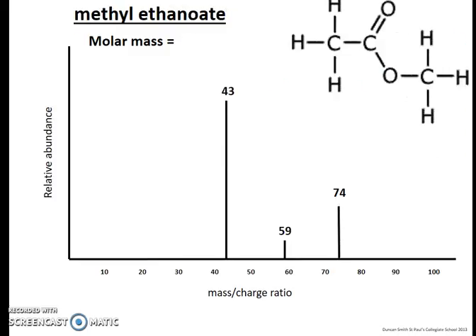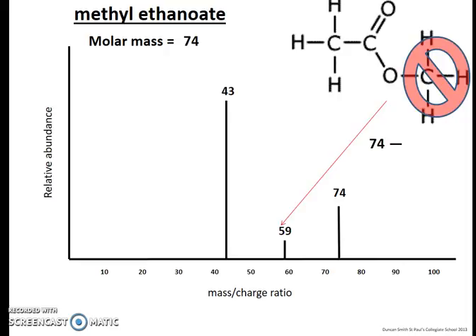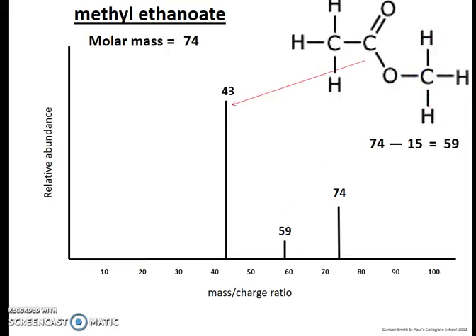Esters are more complicated, but again, if you have a look, the loss of the carbon chains and particularly the loss of the carboxyl chains, so the ones with the carbon chains attached to the single bond oxygen, that tends to be where the split happens, where the most common fragmentation point is.